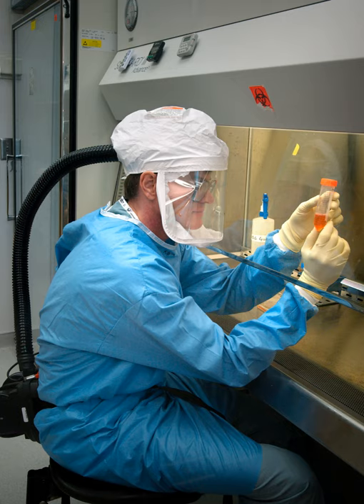These BSCs are commonly used to enclose specific equipment, e.g. centrifuges, or procedures, e.g. aerating cultures, that potentially generate aerosols. BSCs of this class are either ducted, connected to the building exhaust system, or unducted, recirculating filtered exhaust back into the laboratory.